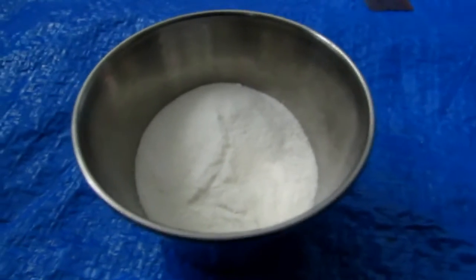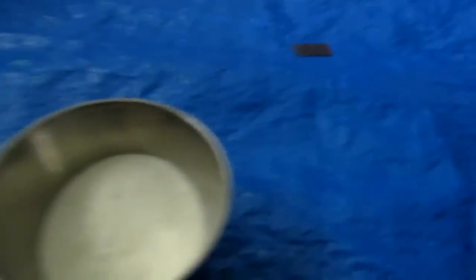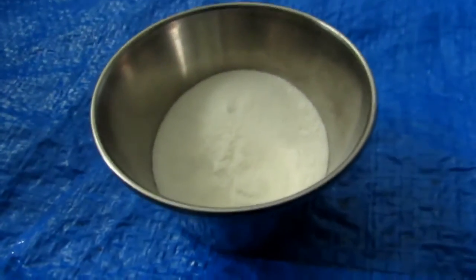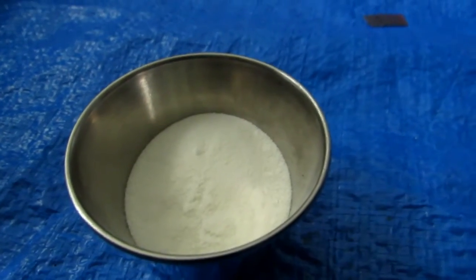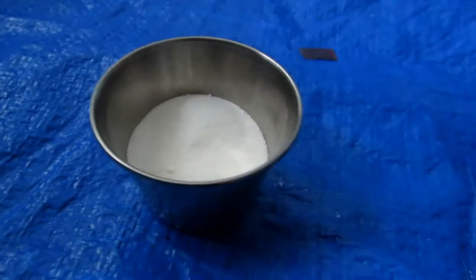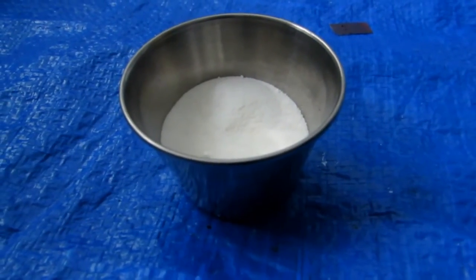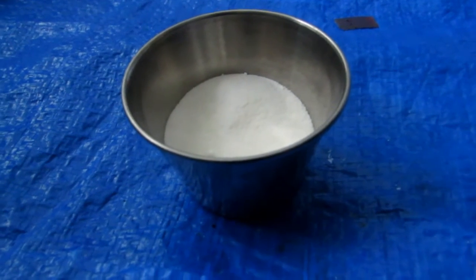Hey guys, welcome back to another video. Today we will be making potassium carbonate from cream of tartar. Cream of tartar can be bought at most grocery stores and is chemically speaking made of potassium bitartrate. I've measured out 25 grams of potassium bitartrate here, and when decomposed it decomposes into potassium carbonate.